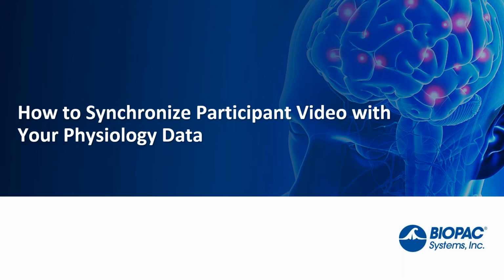This webinar is being broadcast from a special lab called the Emotional Affect Media Center, also known as the BioCube, here in downtown Santa Barbara, California, where it's raining, and we're grateful for the rain. We'll explain more about this type of lab in a minute.